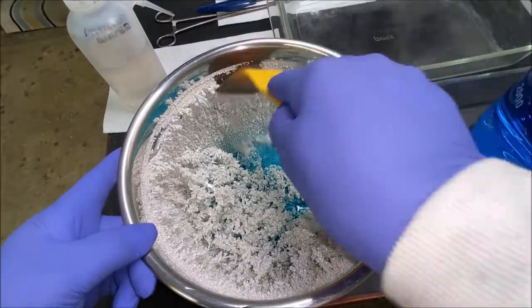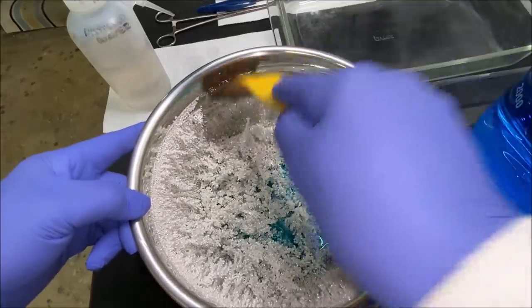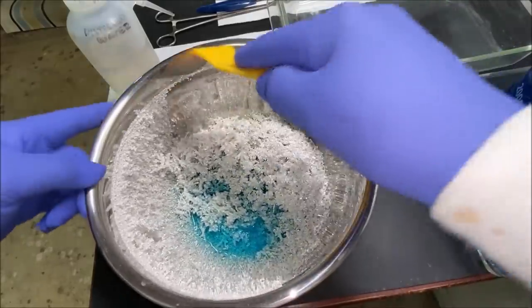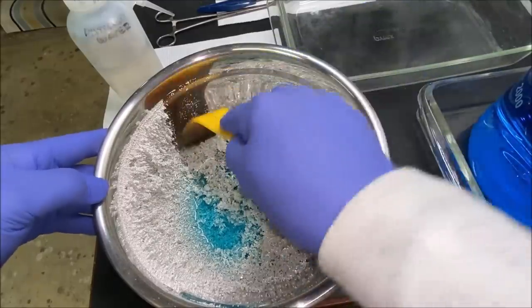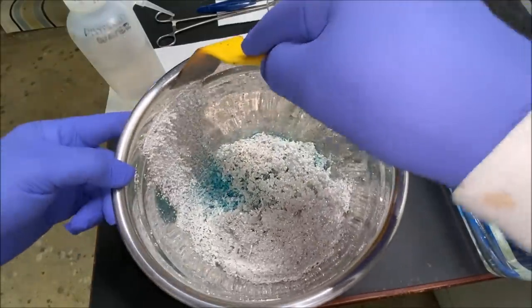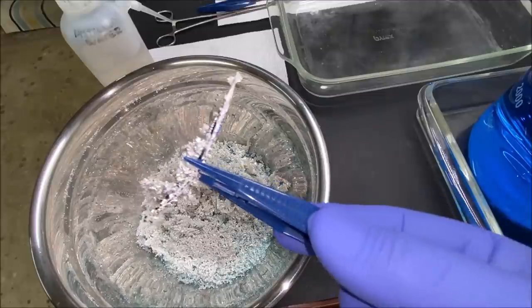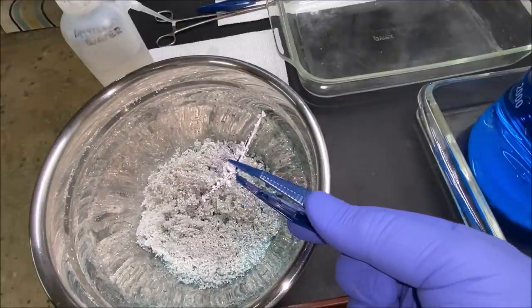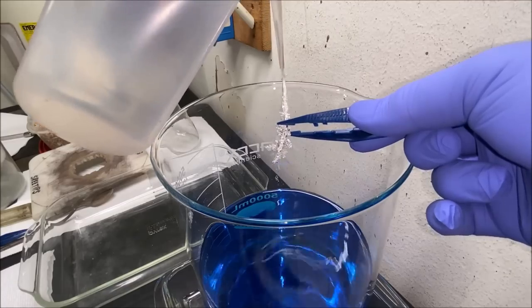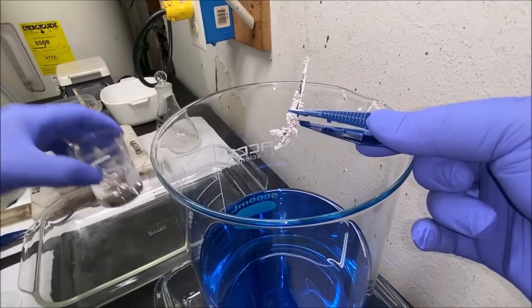I've got a plastic spatula that I bought at Walmart and I'm going to use it to scrape the pure silver crystal off of the inside of the stainless steel bowl — just go all the way around and get it all scraped down into the center of the bottom of that bowl. As I was scraping down the crystals, I spotted another nice, beefy, big, chunky pure silver crystal. I'll rinse this one off with some distilled water and add it to the beaker — we'll set this one aside and offer it for sale on my eBay site as well.